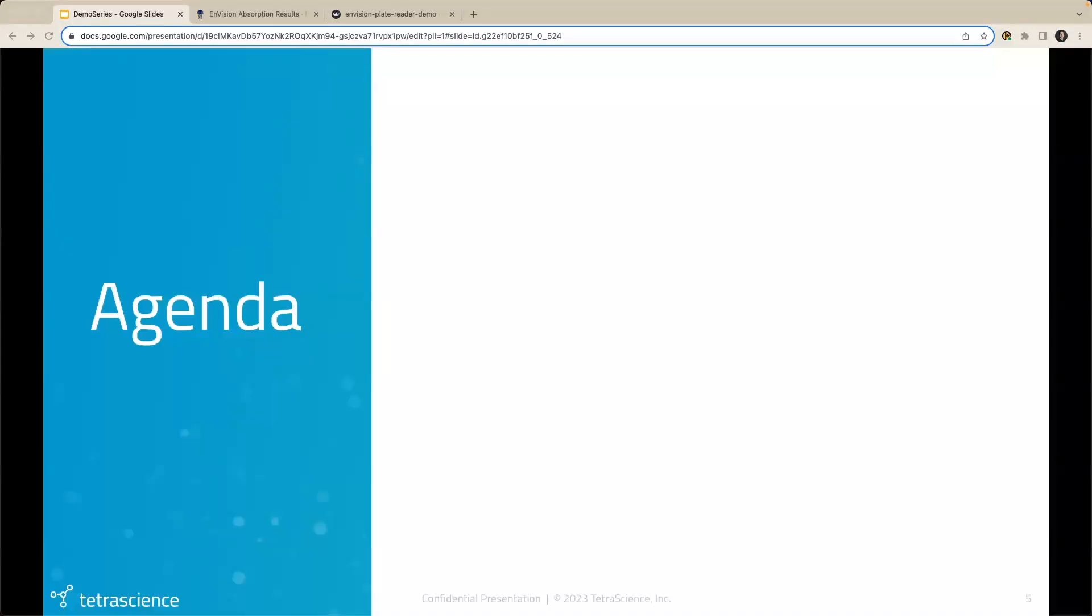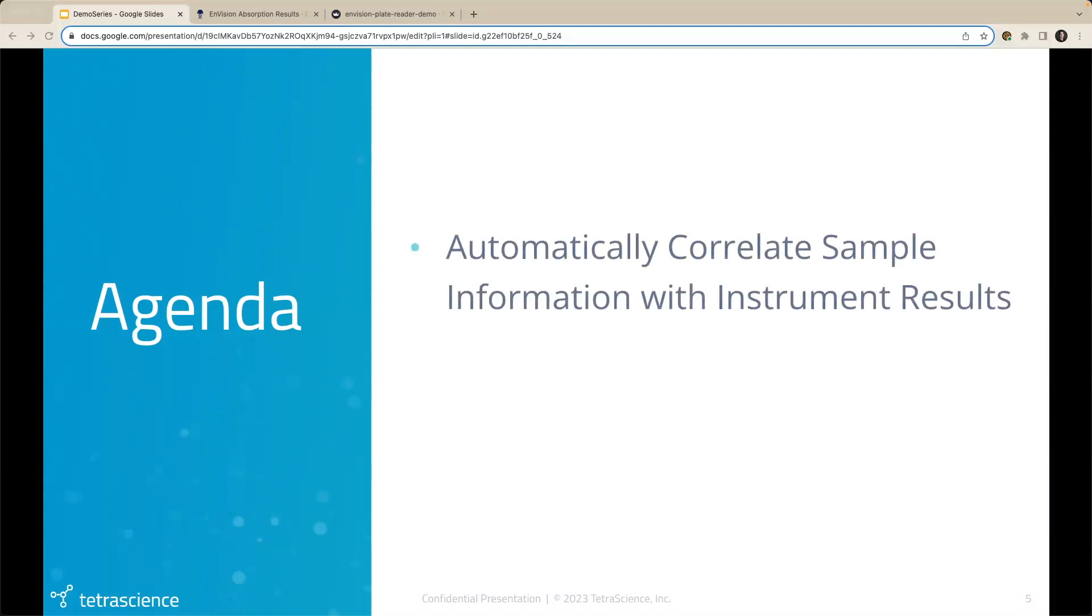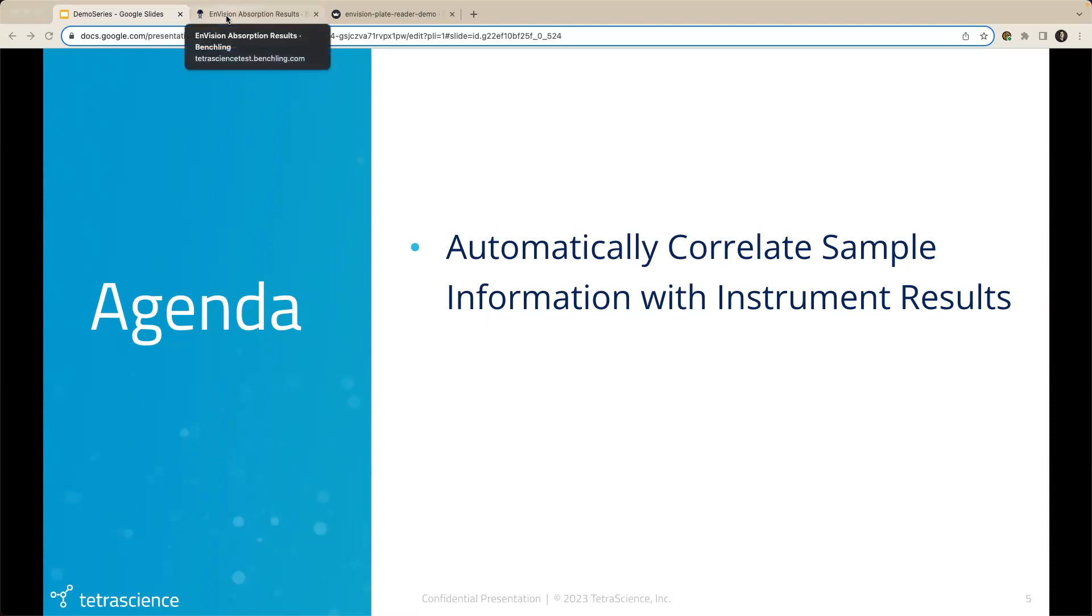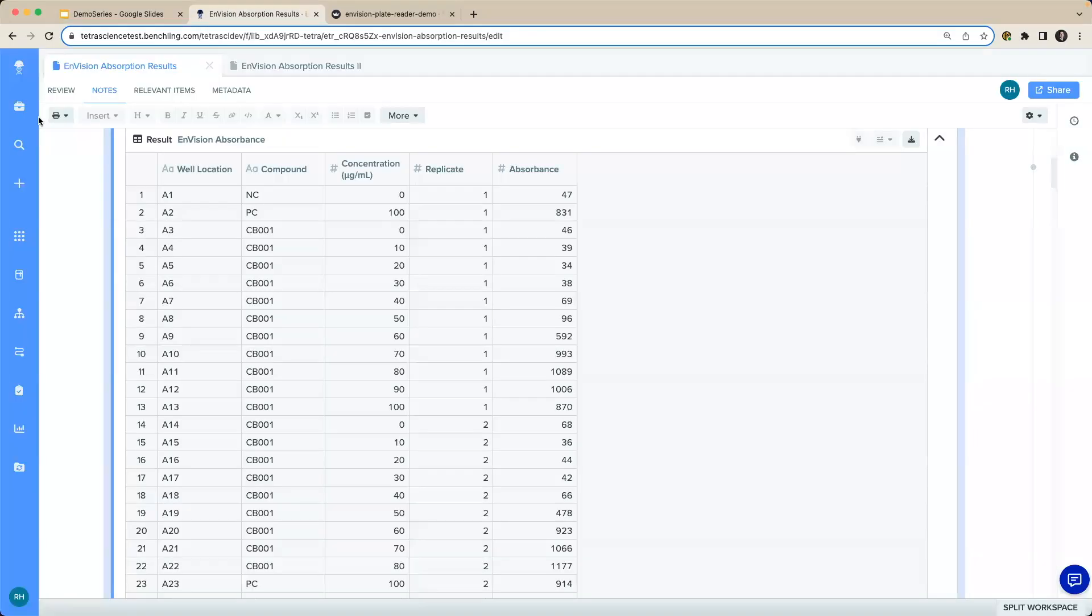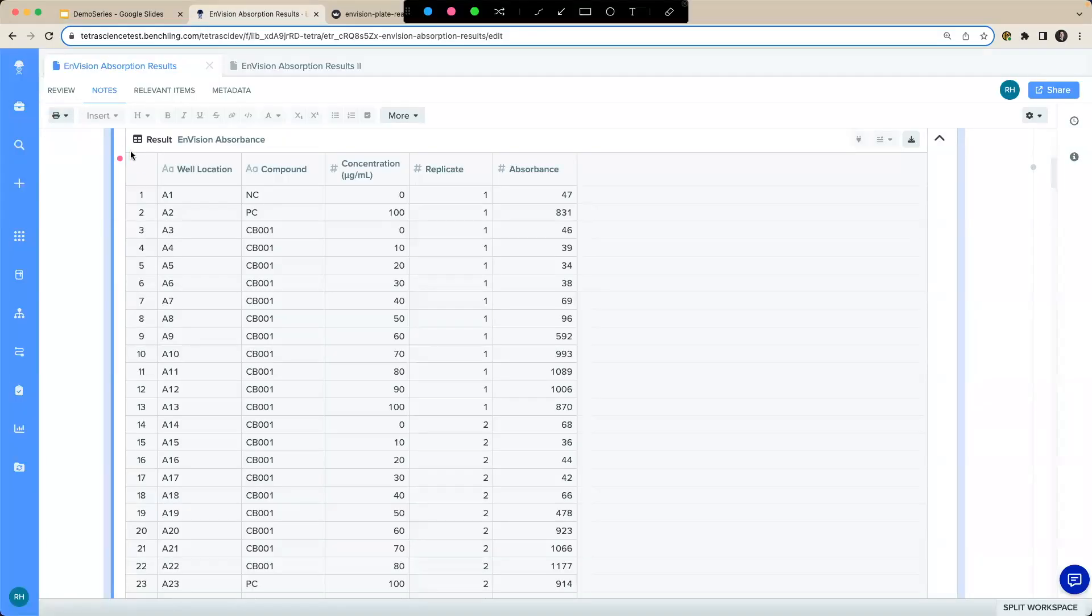With that, let's get into the demonstration. First, we'll see how sample information for a plate reader can be automatically correlated with the plate reader results then surfaced for consumption in an electronic lab notebook. So I'm going to jump to my ELN here. And here we can see sample information from our first four columns has been automatically correlated with the plate reader results in the last column, eliminating the need for copy and paste.